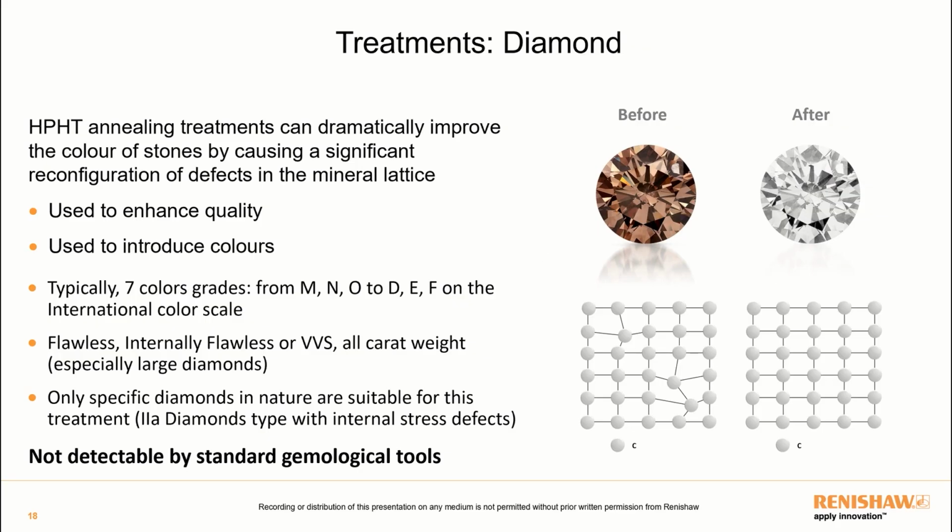Diamonds are a big topic in the gemmological labs, so when in 1999 Lazare Kaplan International and General Electric announced a new method for making permanent improvements in the color and brightness of some diamonds, I can just imagine the worry, especially because at the time the treatment was not detectable by standard gemmological techniques.